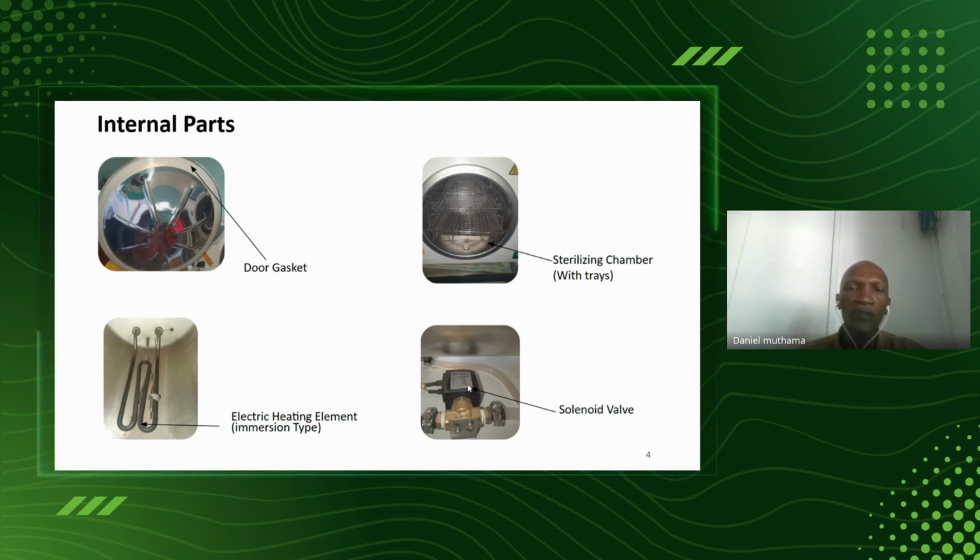Once you switch on the unit, the solenoid valve will be energized and it will allow the flow in that direction. So when the engineer is installing this solenoid valve, it is very important you check the arrow or the direction. At the other side, the arrow is indicated. So if your water is flowing in from this direction to this direction, the arrow will face the same. These are the silicone tubings.